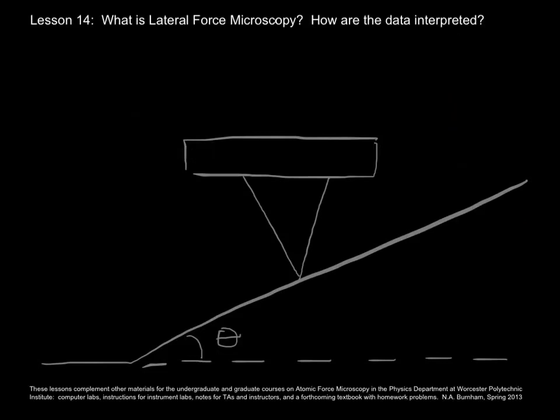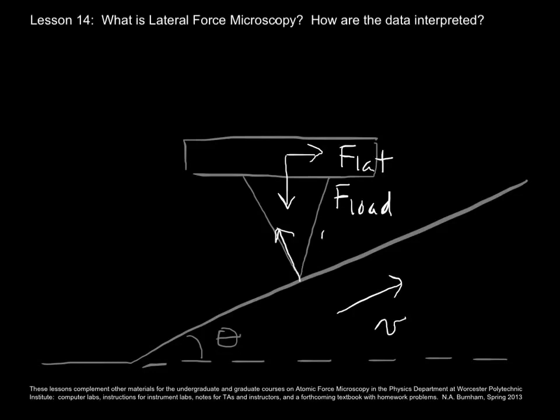What are the forces acting on the tip? The cantilever applies the load, or set point force, but we'll call it load here. It also applies a lateral force that drags the tip up the hill. There's the velocity. The sample applies a normal force as well as a frictional force.